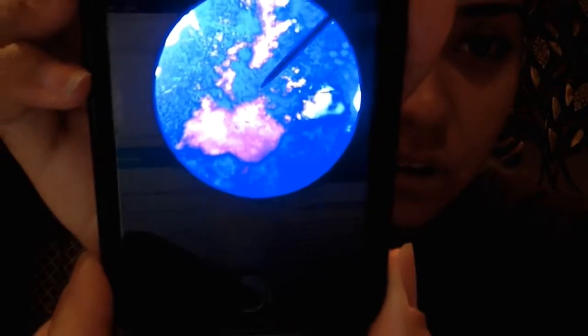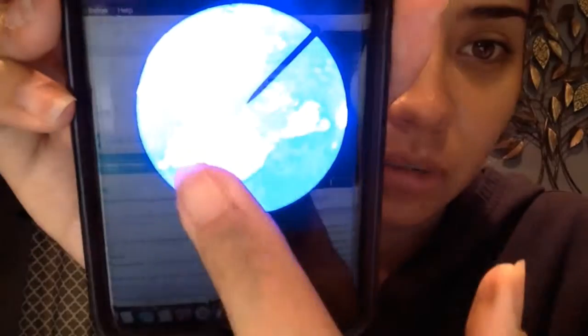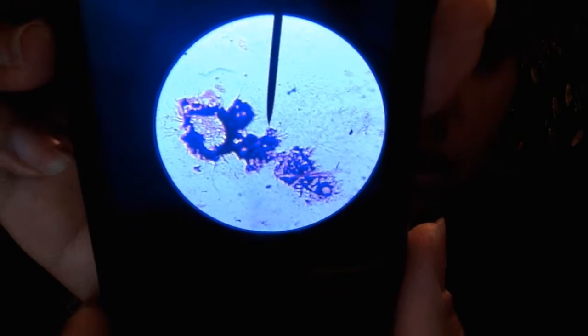Now that I'm done with exercise two — the differential stains of S. epidermis, E. coli, and S. cerevisiae — I want to show the maximum magnification, 600x, of each bacteria. Here is S. epidermis, here is E. coli, and there is S. cerevisiae.